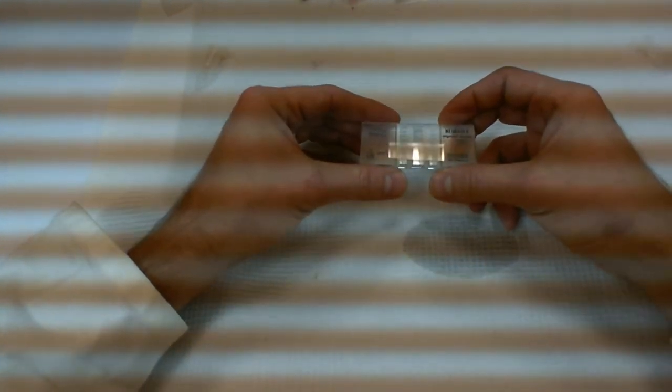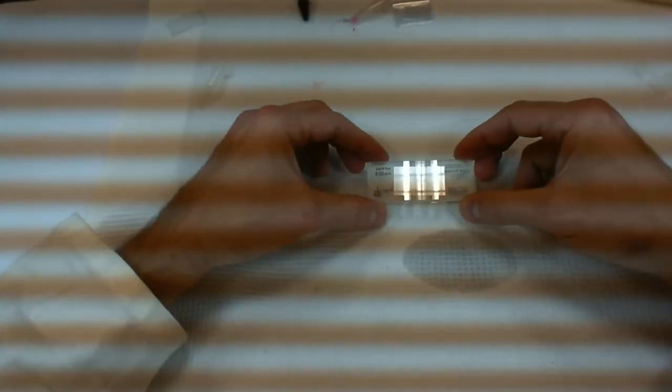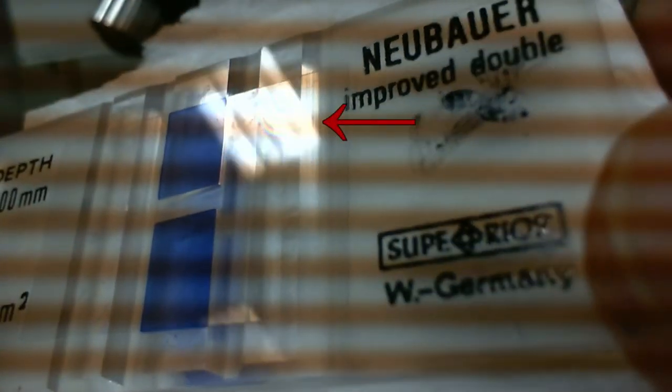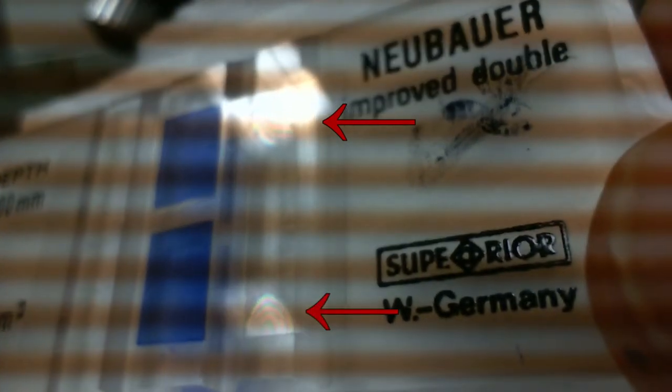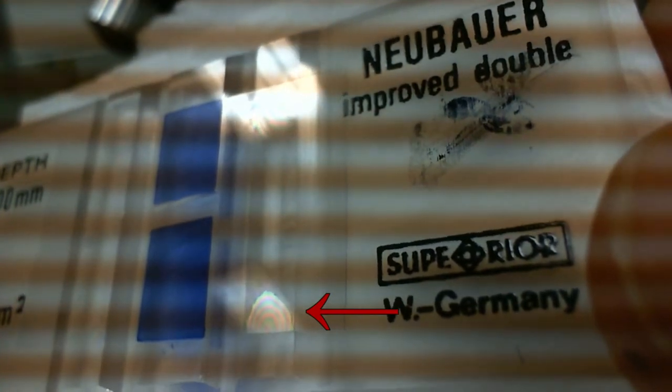Okay. So again, Newton's rings are a sign that your slide is well attached. Unfortunately, it's very difficult to capture that on a camera like this, so I'm not going to be able to show you this. Ah, there they are. Here we go. Upper corner and lower right, you can see Newton's rings. There they are. That's what you're looking for.